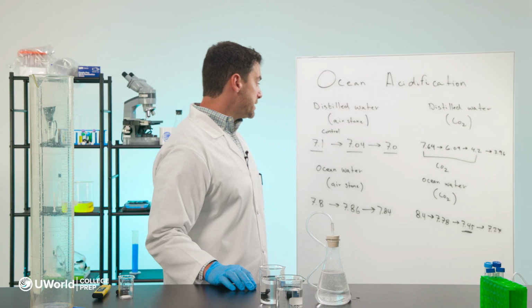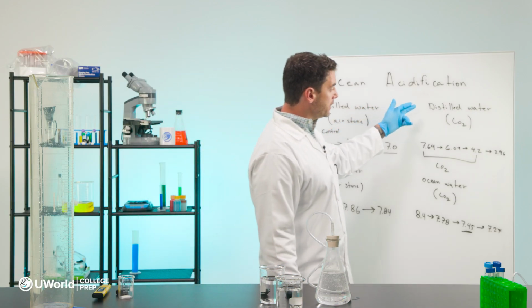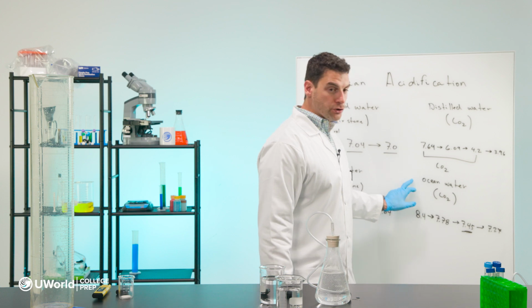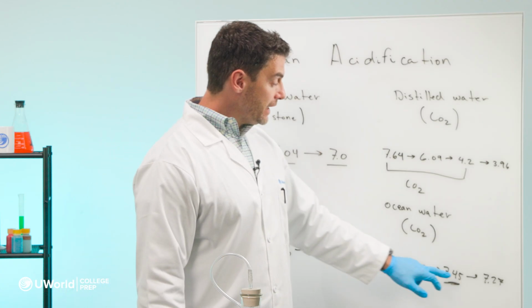So now we have some interesting data, right? We can start seeing some changes. The big thing we can compare is our distilled water with CO2 with our ocean water with CO2. And remember, I talked about our ocean water having some salts already dissolved in it. And you can see the effects of those salts.